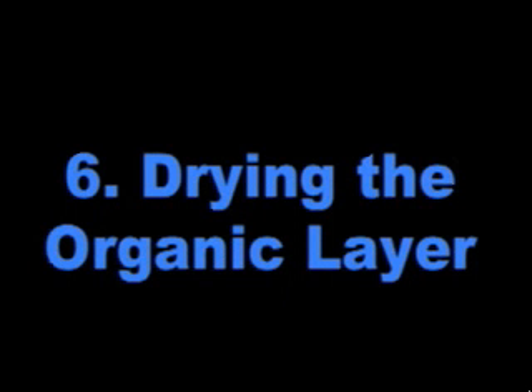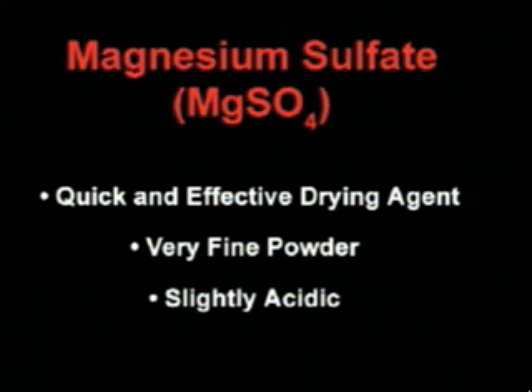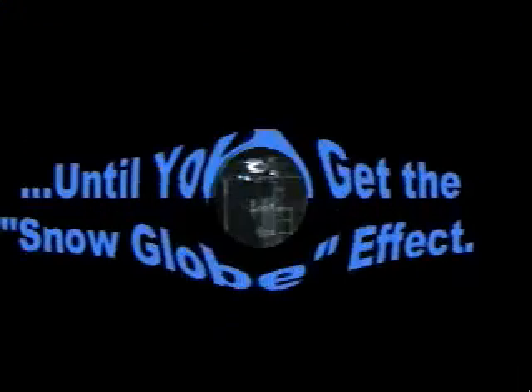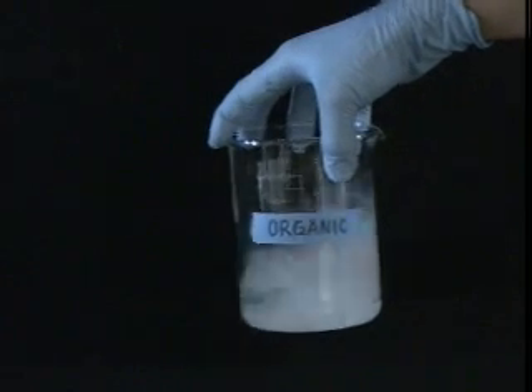Now that you have done all you can with your sep funnel, it's time to dry your organic layer even more with a drying agent. Magnesium sulfate is one popular drying agent because it is quick and effective. It is also a very fine powder, so take care that you don't leave any of your desired material adsorbed onto the surface when you discard it. Keep in mind that magnesium sulfate is also slightly acidic, so it may not be suitable for use with compounds that are sensitive to acid. To dry the organic layer with magnesium sulfate, add a small amount of the powder and swirl. Incrementally add more drying agent and swirl until you get the snow globe effect — there should be free, un-clumped powder in the flask, even after letting it sit for a few minutes.